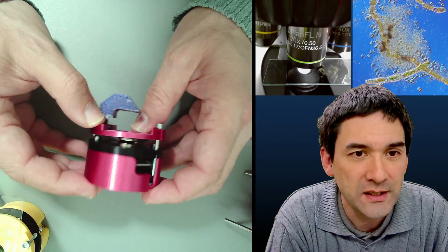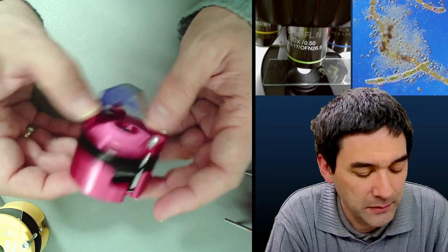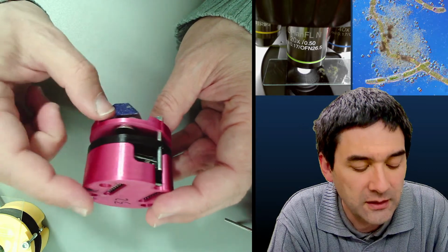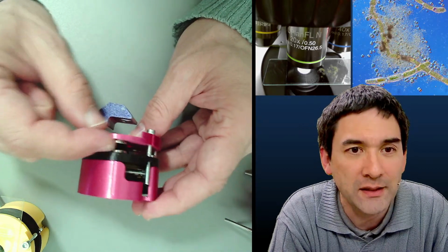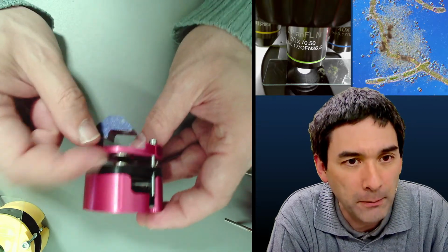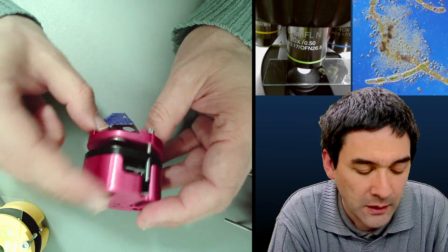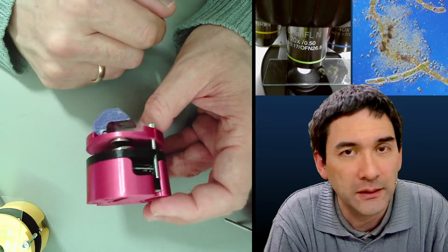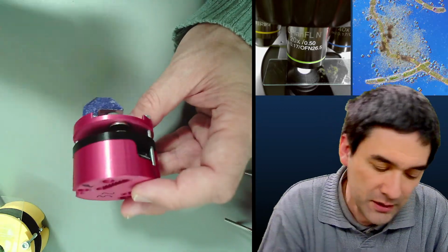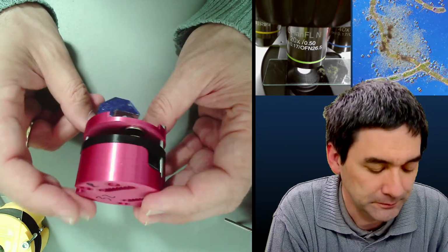I'm going to turn this around. If you press this, you can see that it almost acts like a spring, and by tightening the screws, you're able to change the distance. But there is no spring here. There are actually pretty strong neodymium magnets which push the stage up, and then using the screws, you can adjust the focus. The whole microscope can be assembled simply with this tool, so there is no gluing necessary. Simply put everything together, add a couple of screws, and that's pretty much it.